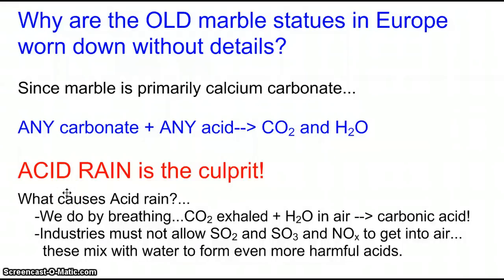The Mission Impossible Lab will be conducted next, and by way of introduction, you have some background information that I want to share with you with regard to marble and acid rain. The connection to your world has to do with the statues, if you've ever traveled to Europe and observed that the statues, especially in Europe where the Industrial Revolution and the pollution was high, are worn down.